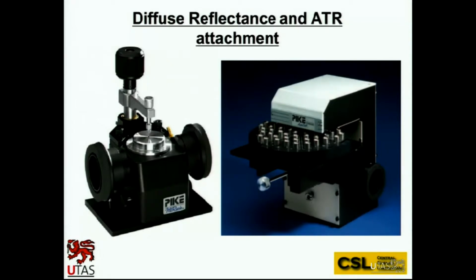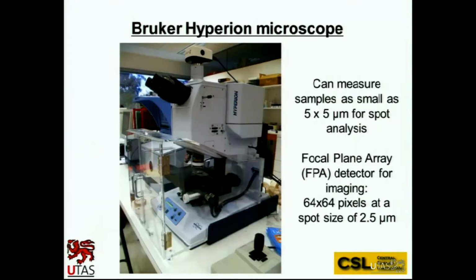This is very useful, for example, for soil analysis, and we're just conducting a fairly big national approach with carbon in soil, where we're able to measure all sorts of different carbon simply by using mid-infrared spectroscopy, and then using existing models that were developed on a national basis to predict what certain carbon values you have in your soil. So a very handy attachment.